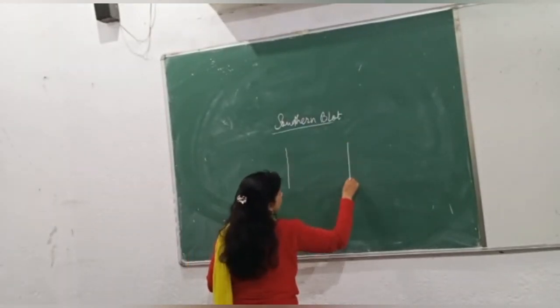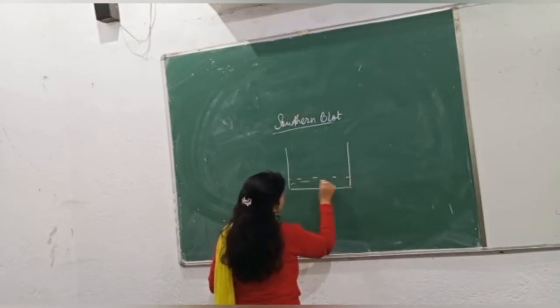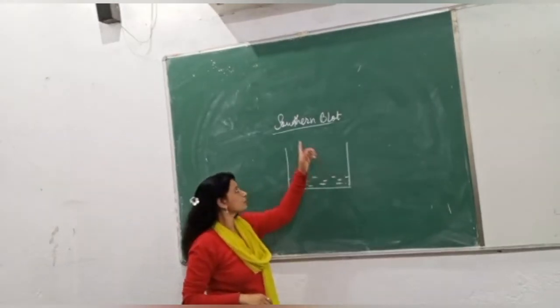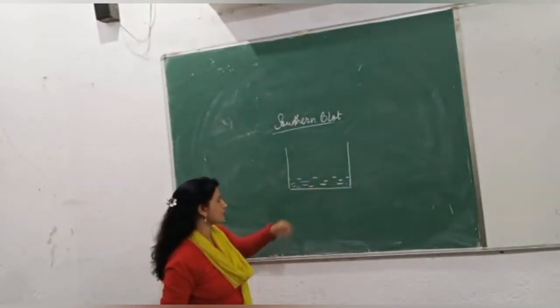This is a chamber which has got a buffer solution. You always need a buffer solution. Right now I am doing the method of Southern blot. Finally I have come to this point which I am supposed to discuss today in my class.